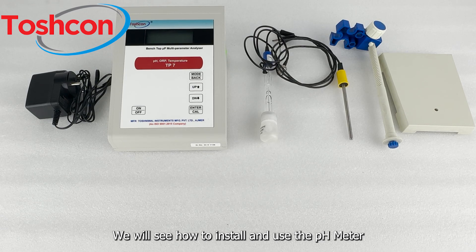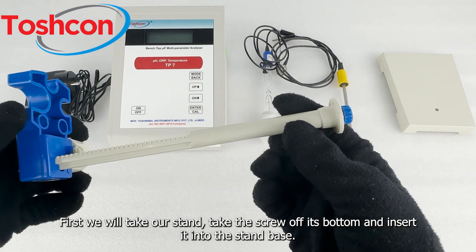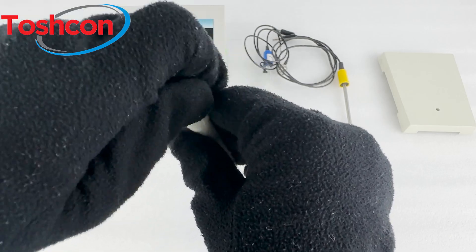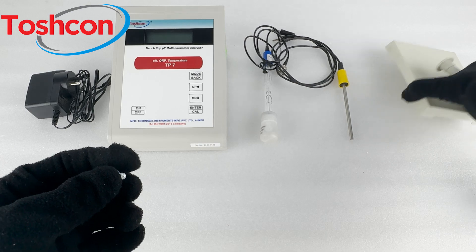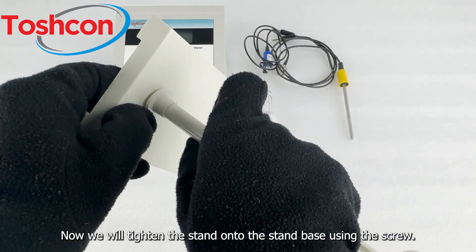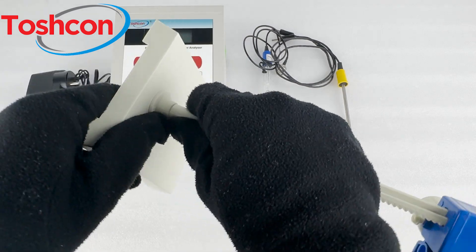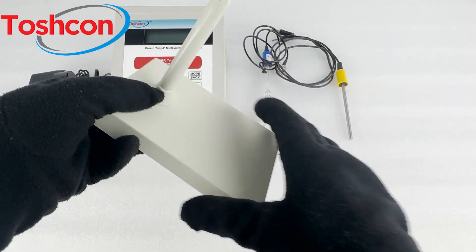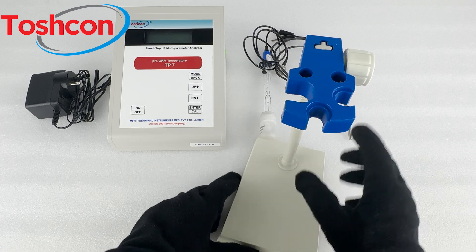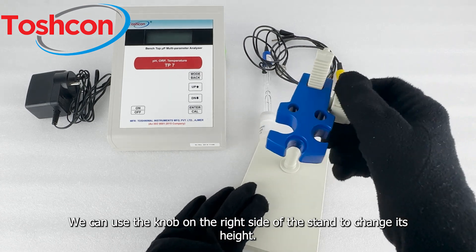We will see how to install and use the pH meter. First we will take our stand, take the screw off its bottom and insert it into the stand base. Now we will tighten the stand onto the stand base using the screw. We can use the knob on the right side of the stand to change its height.